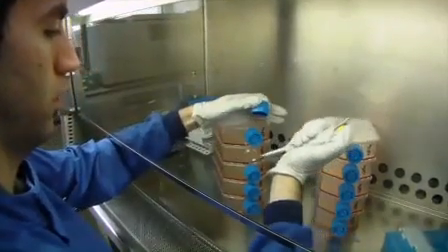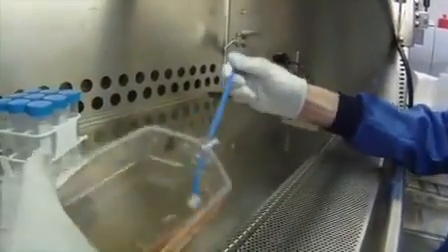10 confluent flasks of cells are induced by treatment with 10 micromolar cadmium chloride for 16 hours before being scraped off into media.